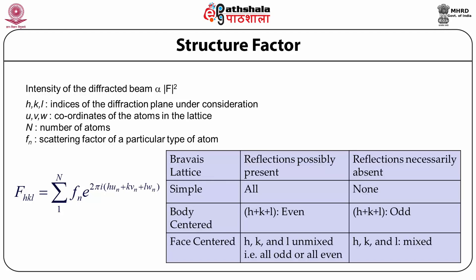In structural determination, phases are estimated and an initial description of the position and anisotropic displacements of the scattering atoms is deduced. From this initial model, structure factors are calculated and compared with those experimentally observed. Iterative refinement procedures attempt to minimize the difference between calculation and experiment until a satisfactory fit has been obtained.